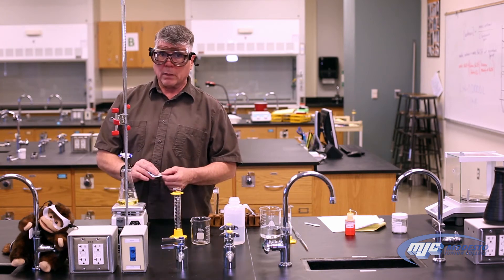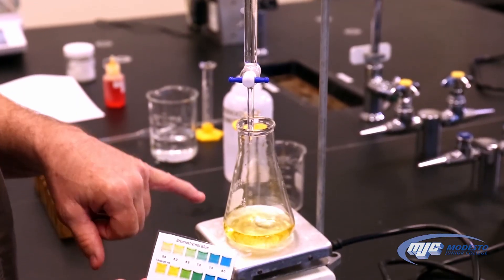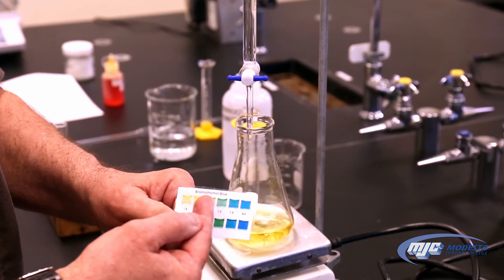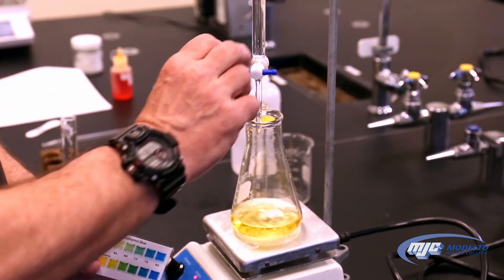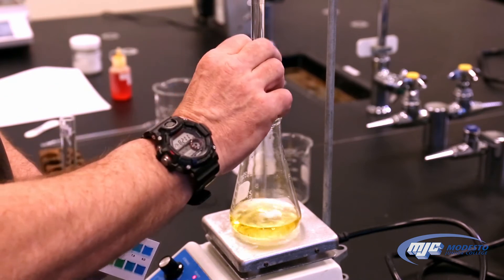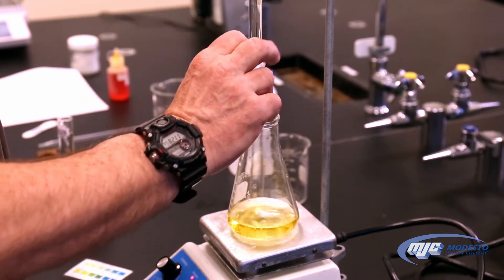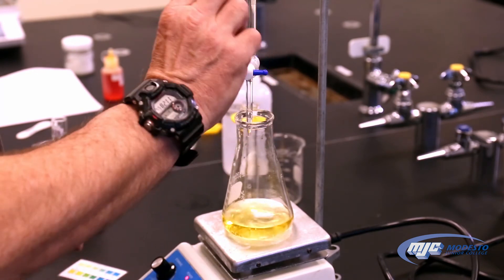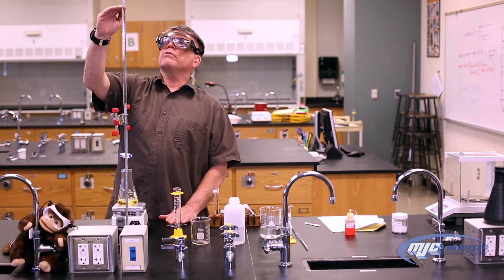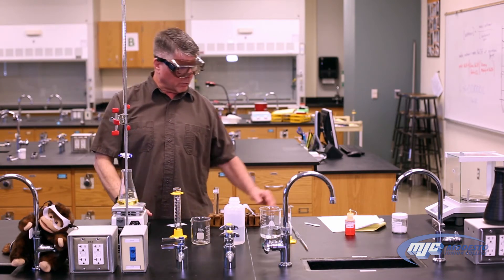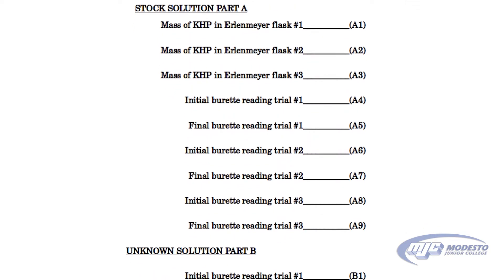Put the flask back on the stirrer and we're ready to start our titration. The indicator Bromothymol Blue changes color at our equivalence point — you can see now it's yellow and we're looking for it to change to green. Sometimes it goes right from yellow to blue, and that's okay. We want to be as precise as possible so that one drop makes it go from yellow to green or blue. The way we do that with the burette is to twist the stopcock 180 degrees — the faster we twist, the slower we add solution. We need to read our initial volume to two decimal places: that will be A4 for the first trial, A6 for the second trial, and A8 for the third trial.